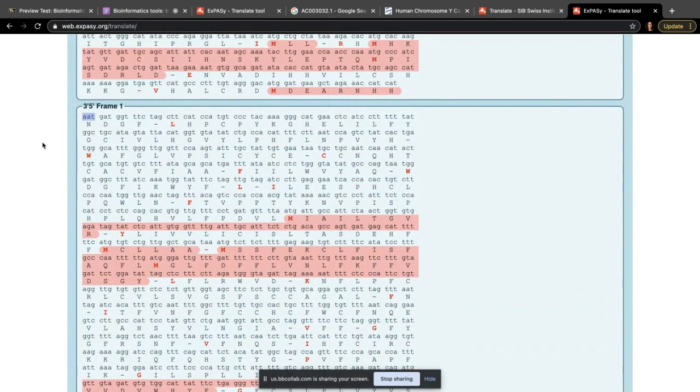It's AAT. So really, it's not just reading from end to beginning. In reality, what the computer did was reverse complement that strand. So the reverse complement of TTA is AAT. So the computer is doing the right thing. The only problem that I see with this is this name. To me, it leads people to think that the computer is doing something else. But anyway, nobody asked me, as I said.